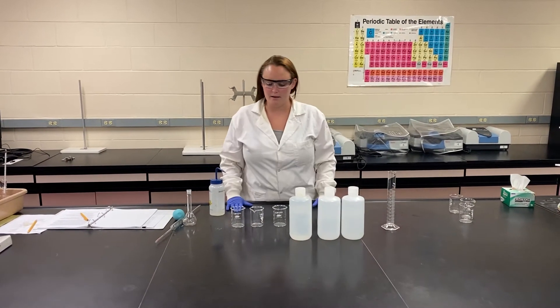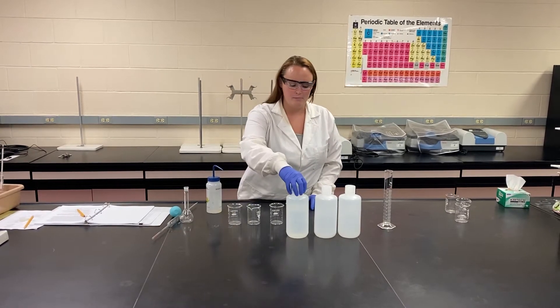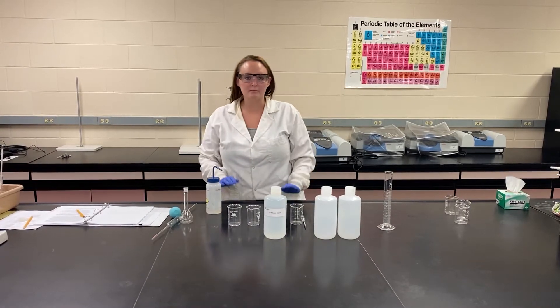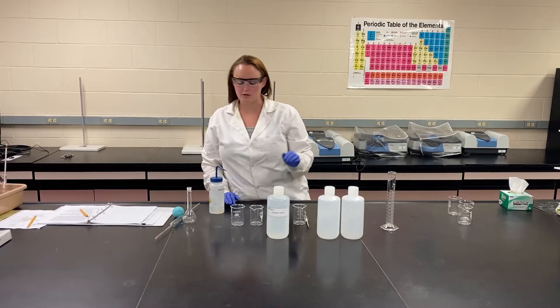Today we're going to be doing salt solutions or specific gravity. We are going to start with our stock solution. Our lovely stock room has provided us a one molar solution to start from.